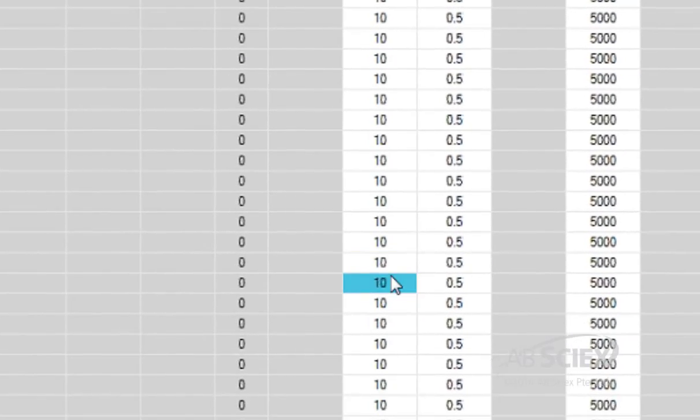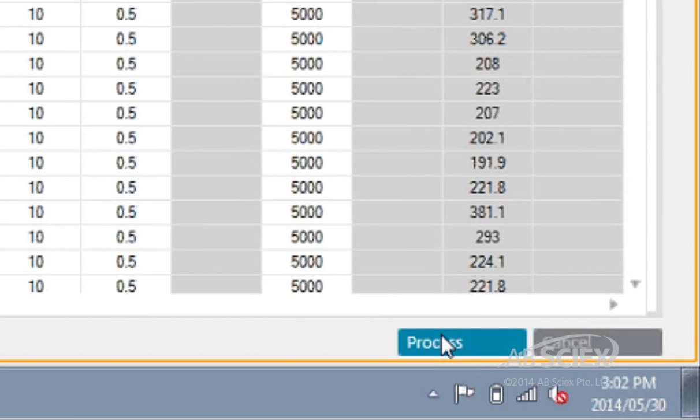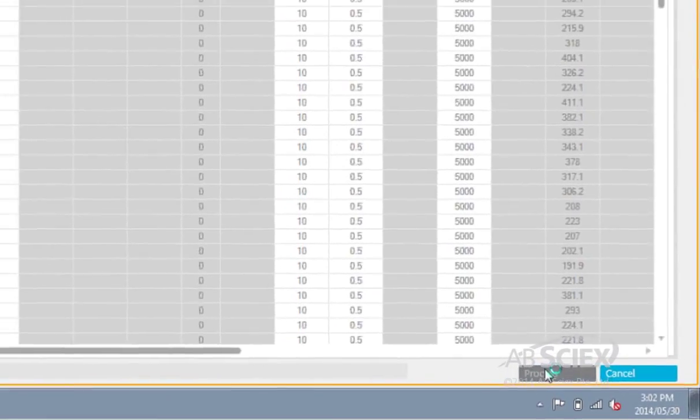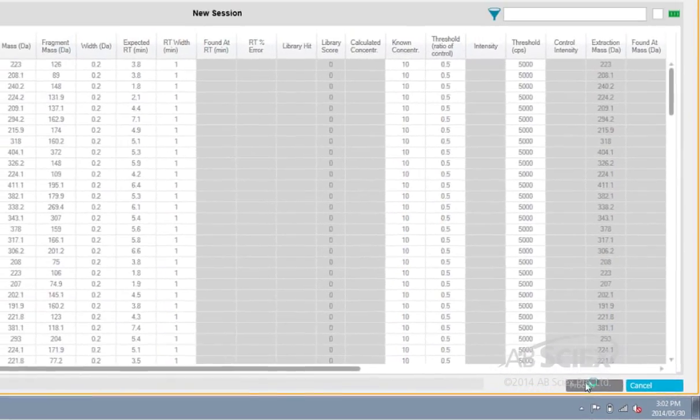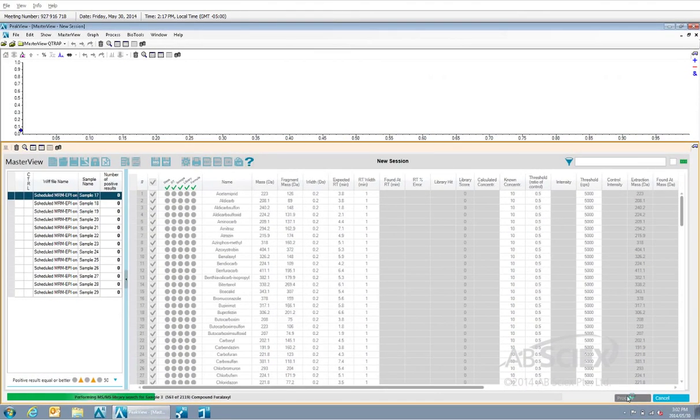Now, all we need to do is click the process button, and our 13 samples will be screened against our pesticide list and pesticide library to identify which of these pesticides were detected in our samples.